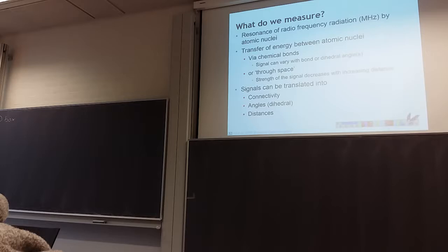And this energy difference corresponds to radiation. The difference in energy between the two states corresponds to a certain frequency of electromagnetic radiation. In this case, it falls in the radio frequency band, typically about 100 megahertz. It depends on the magnetic field that you apply: the stronger the magnetic field, the bigger the energy gap, so the higher the frequency.